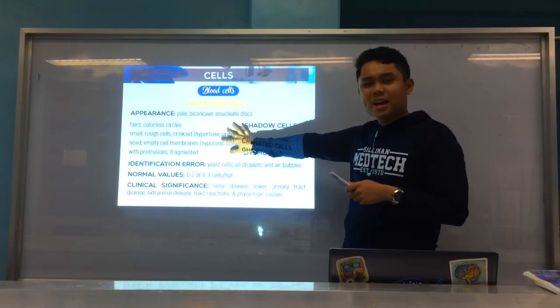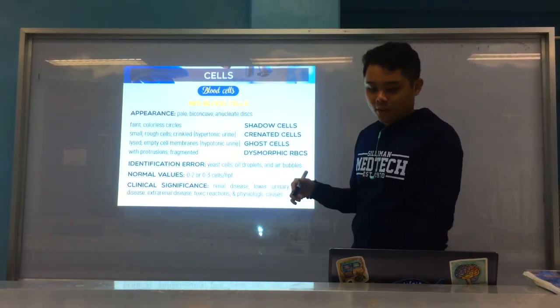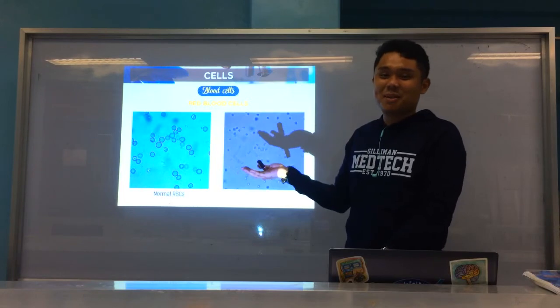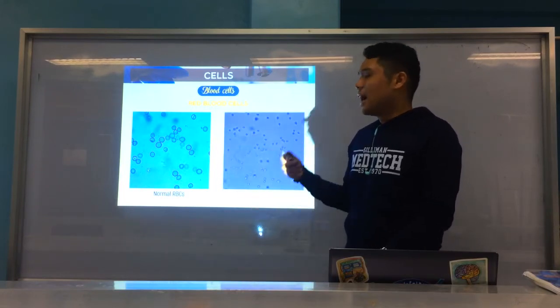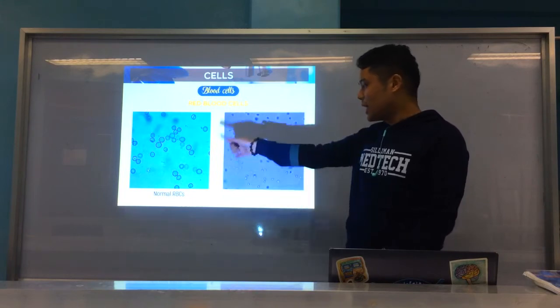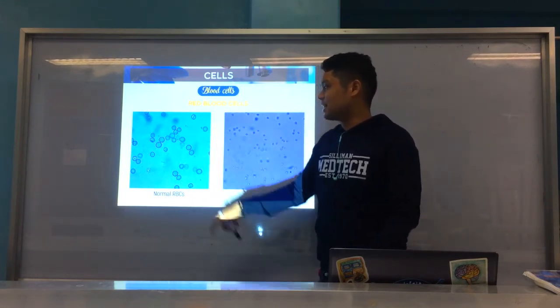Terms like hypertonic and hypotonic, okay? A general principle of that. And for some pictures, this is your RBCs. You will find them in every urine specimen. It is very difficult, as in, personally I still get confused about which are RBCs, because they are hard to identify. But usually, they are biconcave, anucleate discs, okay?